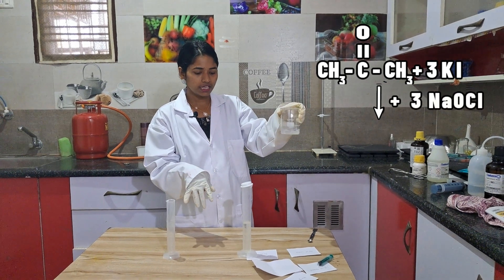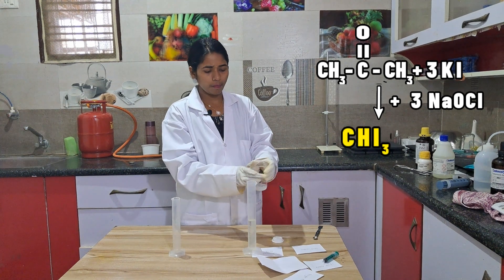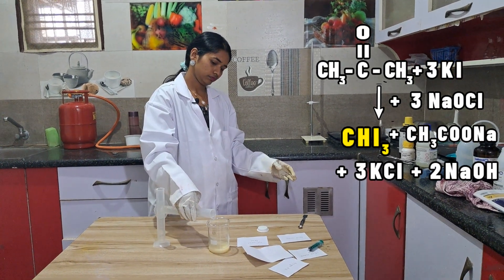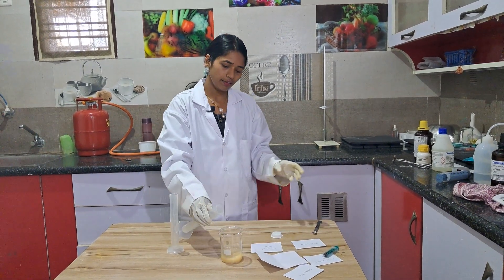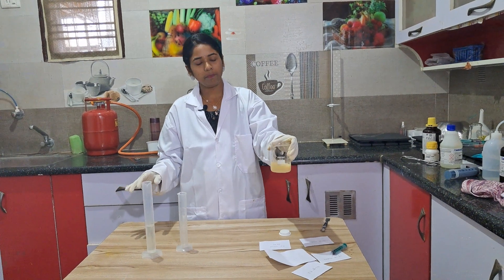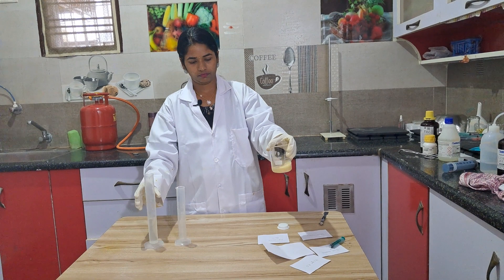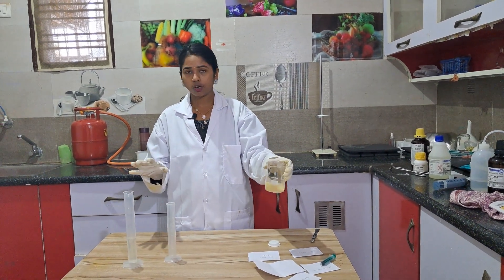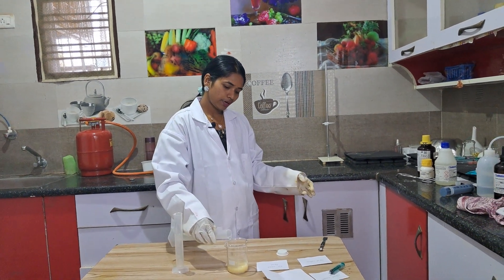Now I am going to add NaOCl — sodium hypochlorite. Add drop by drop and shake well. A few more drops will be added. If you shake well, the reaction will proceed perfectly — molecules will react. Better you wear gloves and apron for every experiment. You can wear a mask and lab goggles as well.